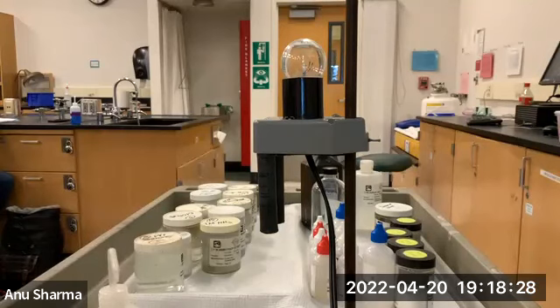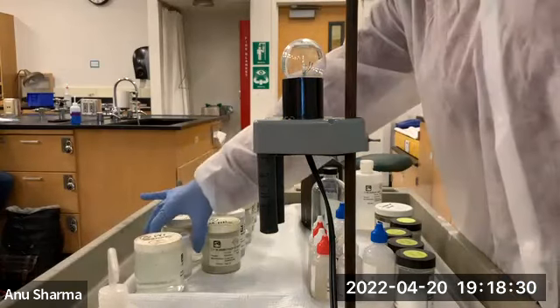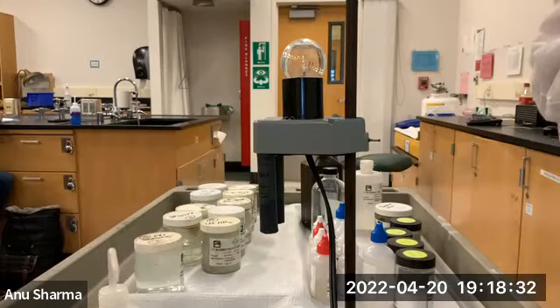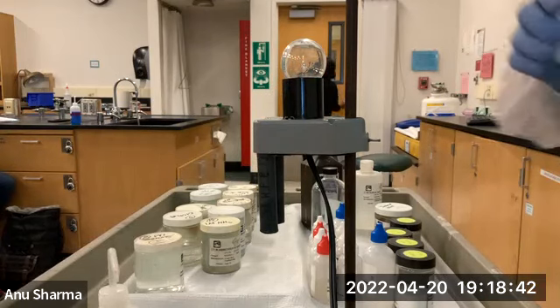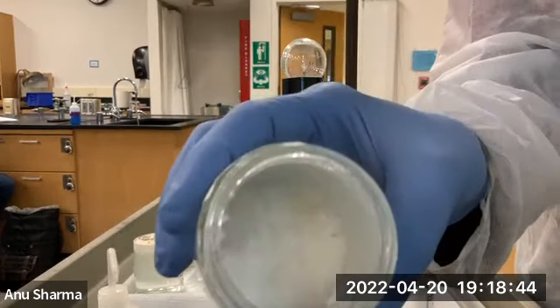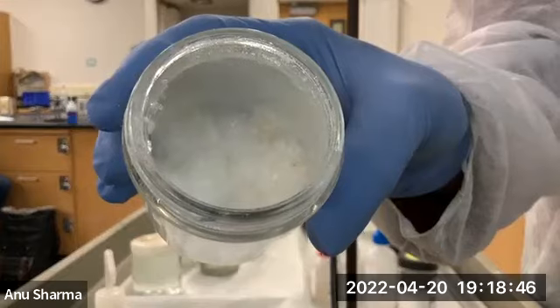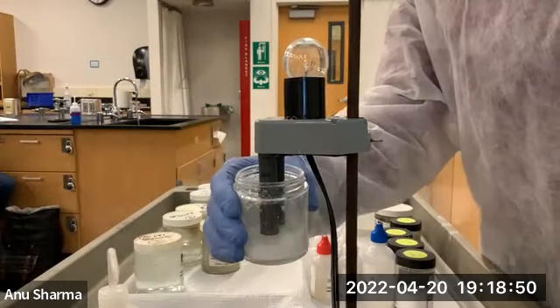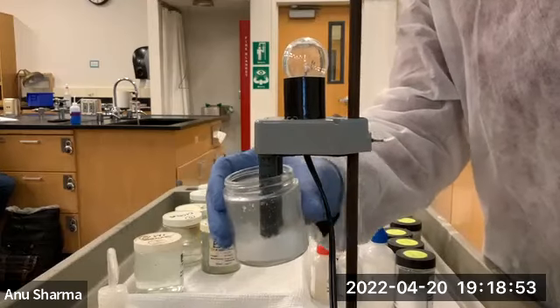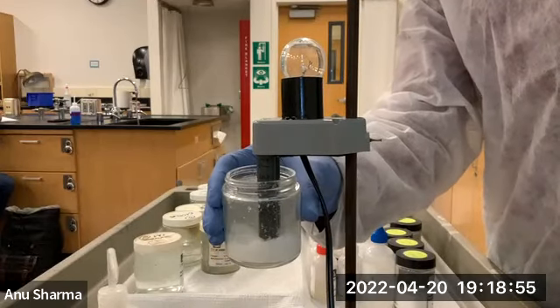Next is number 7, sucrose. Sucrose contains lots and lots of OH groups. Sucrose is a sugar, and this sugar is white, solid, crystalline, as you can see. A solid obviously will not conduct electricity. So here I am putting sucrose there.